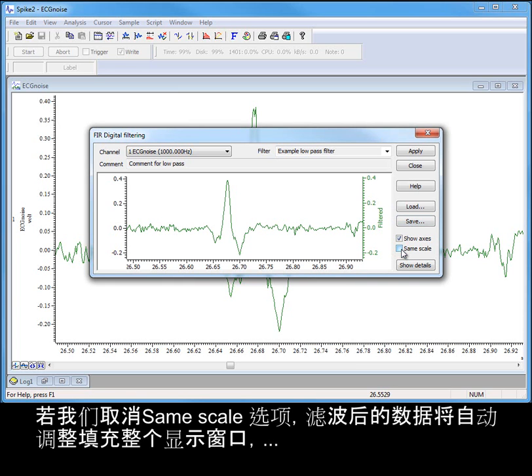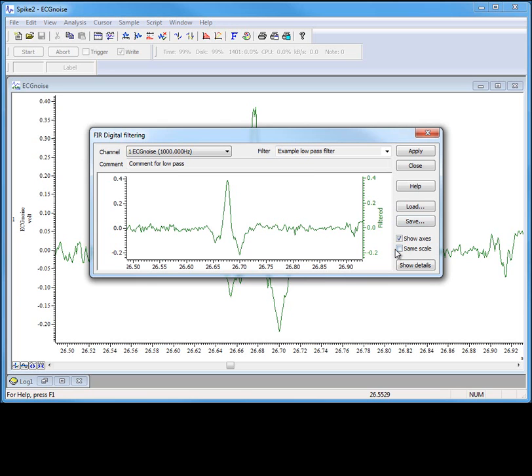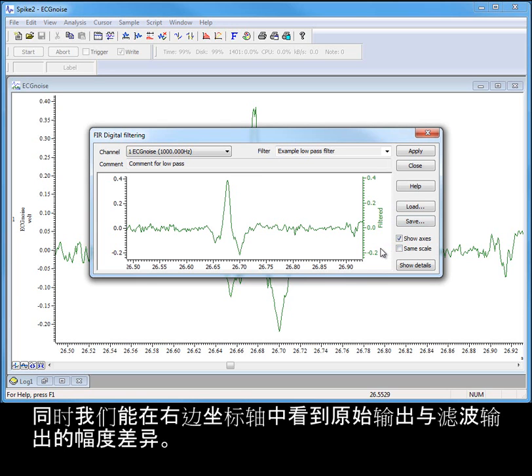If we uncheck the same scale option, the filtered data is scaled to fit the display window, and we will be able to see the changes in amplitude between the raw and filtered output on the right-hand axes.